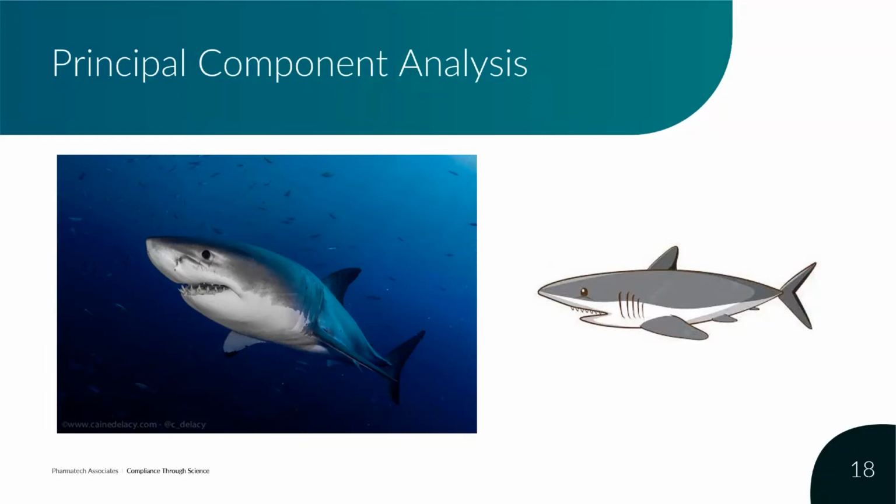And in a similar manner, partial least squares, which is kind of an extension of principal component analysis, works in a very similar manner. Everybody uses ordinary least squares when you're doing something like linearity, or where you only have a couple of variables that aren't collinear.